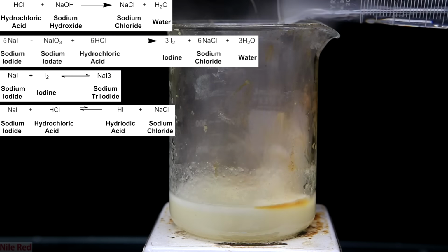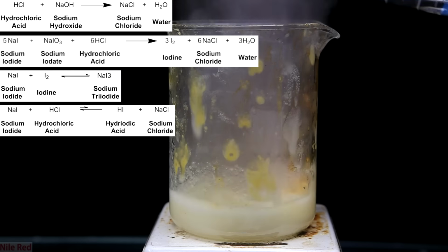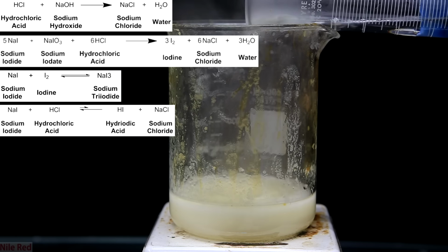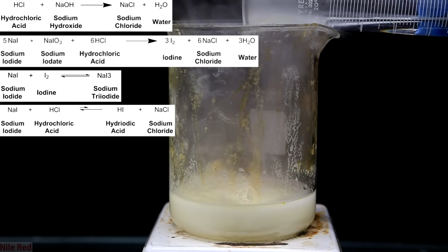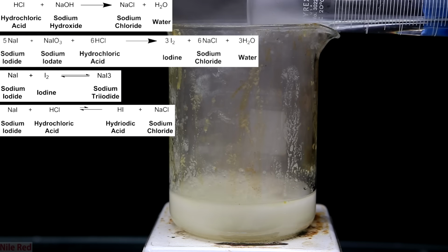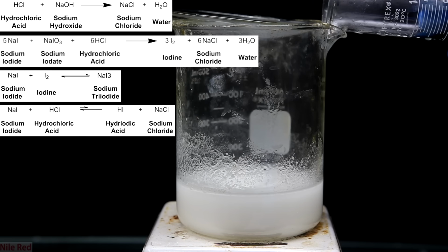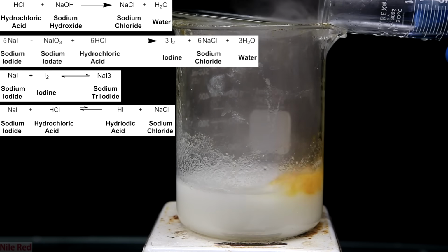The final thing that's occurring to some degree is some of the sodium iodide will react with the hydrochloric acid to produce small amounts of hydriodic acid. Hydriodic acid is a stronger acid than hydrochloric acid, so the formation of a stronger acid from a weaker one is not very favored at all. It's an equilibrium reaction where the products aren't very favored, so the amount of hydriodic acid that's produced is going to be very small to almost insignificant.